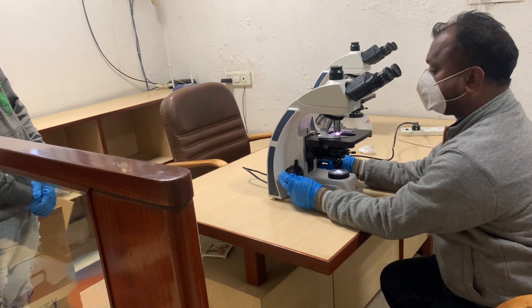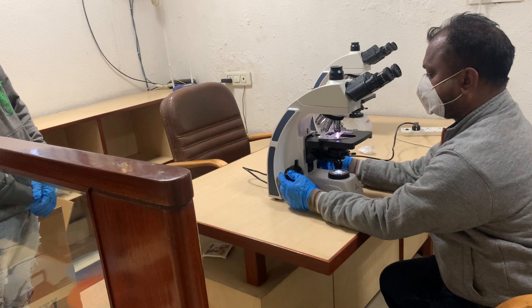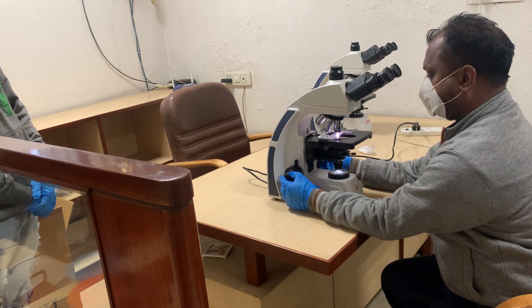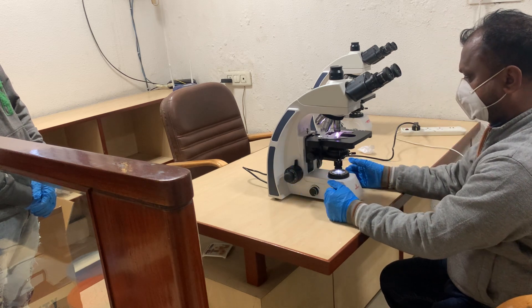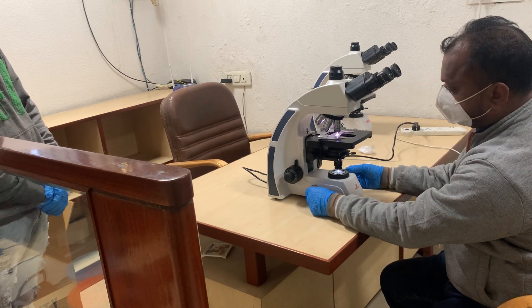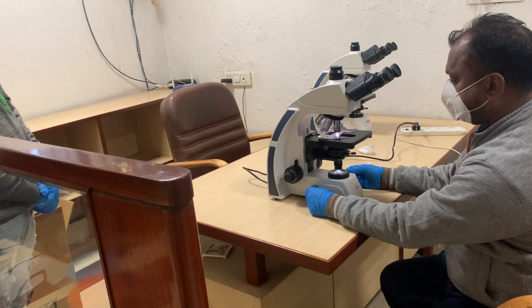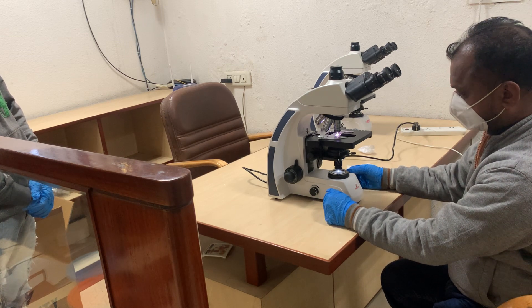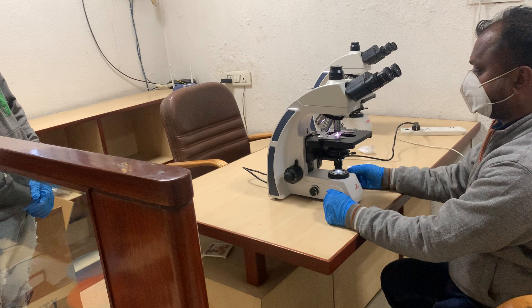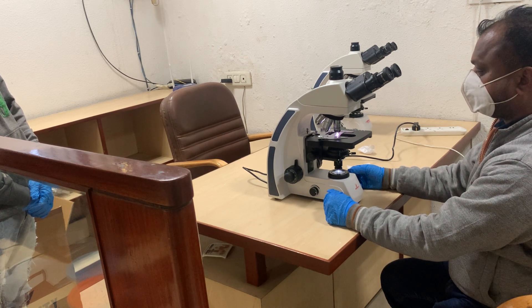The coaxial focusing control has both coarse and fine motion. The bigger knob is the coarse motion knob and the smaller knob is the fine motion knob for precise adjustment. It also has an intensity regulator which increases or decreases the light intensity as required. This is how you install the IOX 7 Delta microscope from Infinity Optics.